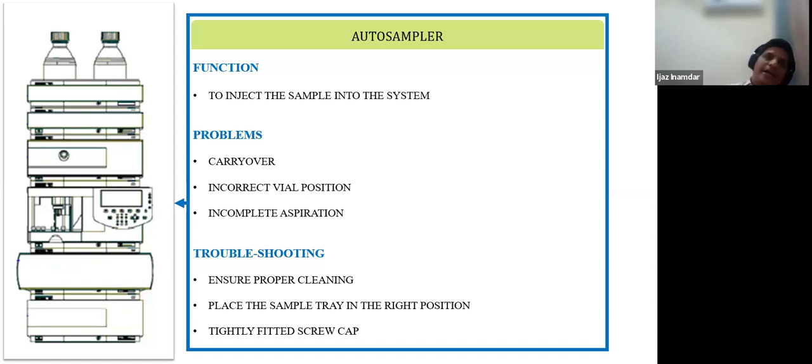One application that I understand we generally do is amino acids. In amino acid analysis, the vendors provide a specific kit, and everything is automated. You don't need to do any sample preparation, at least for the labeling part, manually. You can just give a set of commands to the auto sampler: mix this, keep it stable and let the reaction proceed for 15 minutes, and then inject it into the system. So this is an intelligent use of the LCMS, or the auto sampler.